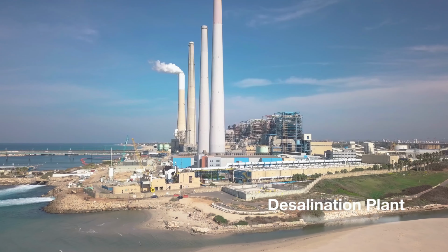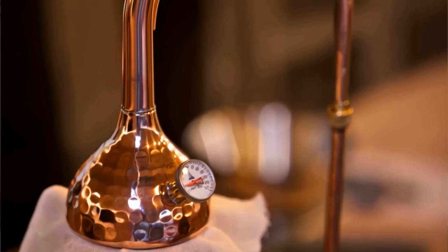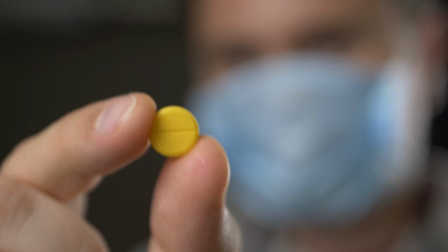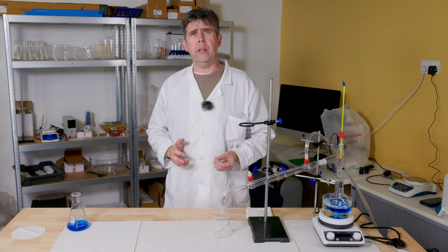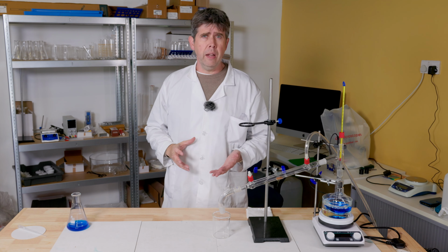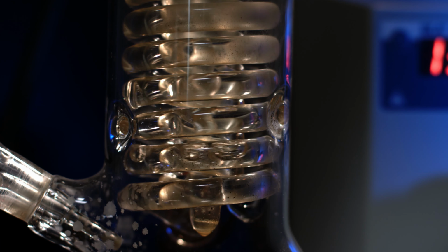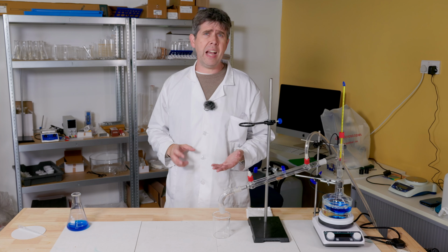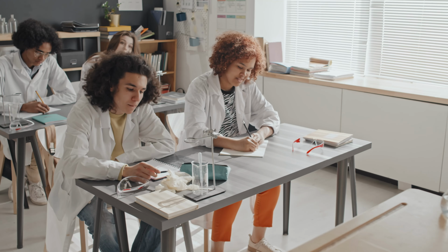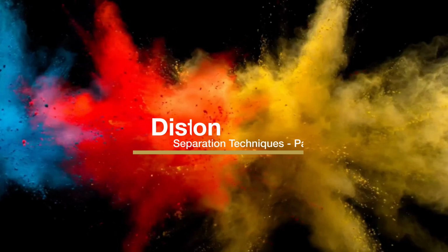Whether we are purifying water, alcohol, or the medicines that keep us alive, distillation is a key tool in the chemist's arsenal. In this video, we will look at how distillation can be used in the modern chemical laboratory, and we will cover the key aspects of this technique that you will need to know to get a GCSE in chemistry.